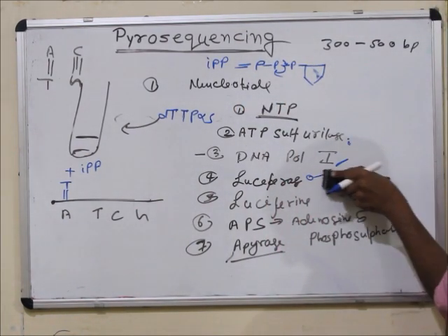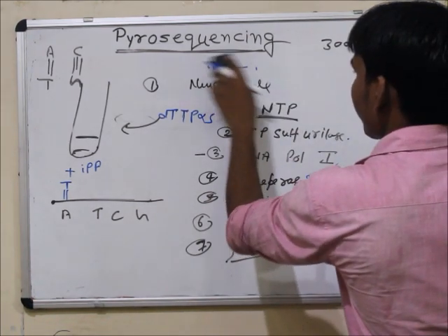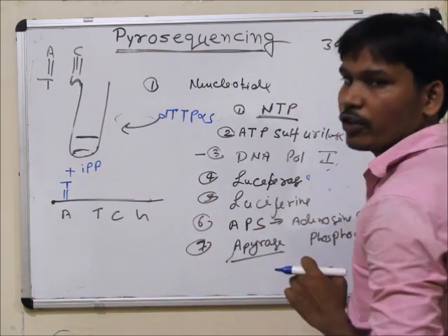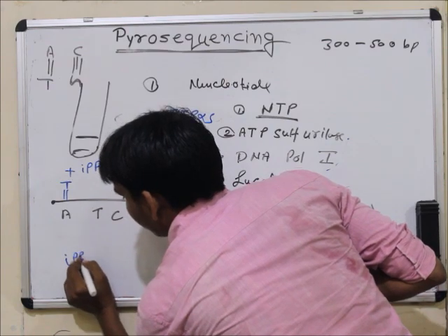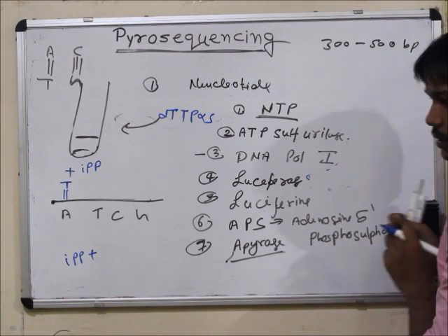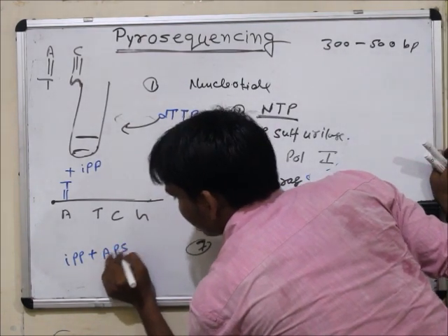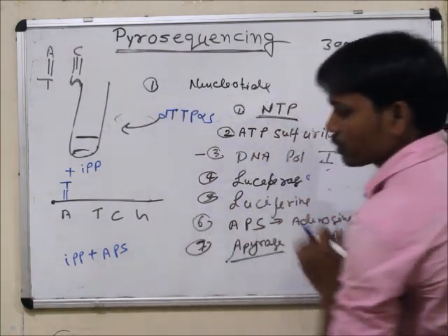Then the next steps are involved for detection, for determination of the sequence which is added. Inorganic pyrophosphates released, plus adenosine 5-phosphosulfate, APS.